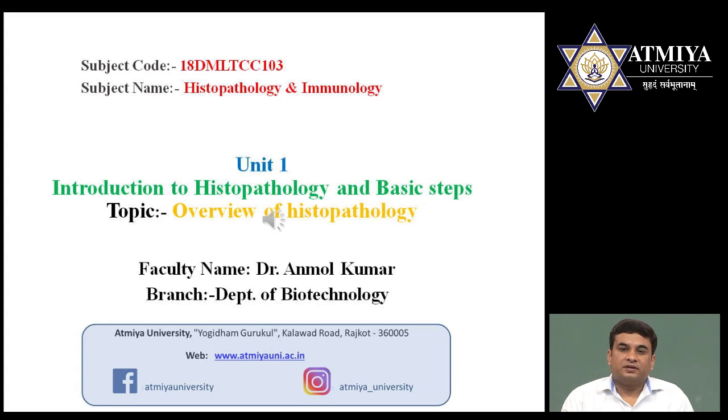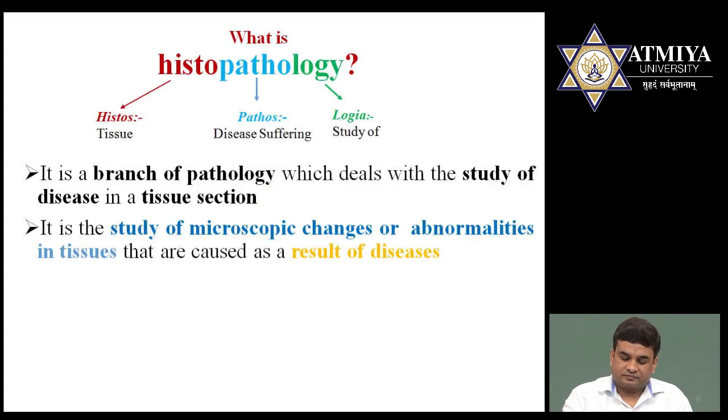Today I am going to cover the topic overview of histopathology from Unit 1, introduction of histopathology and basic steps. In this video I will cover the basics of histopathology and its applications in various fields. Next I will cover the different types of specimen used in the histopathology laboratory. And in the last section of my video I will cover how to handle the specimen in the laboratory and what the grossing experiment is.